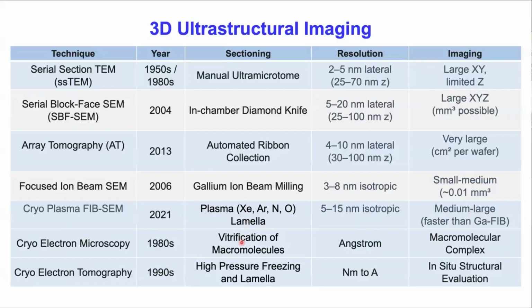And then this is going to be used for 3D. As you already know, single particle analysis can be done for 3D imaging of macromolecules. It has been developed since the 80s, and after the development of direct electron detectors, multiple lenses, and along with the development of software, it is now possible to generate 3D imaging at angstrom resolution by cryo-electron microscopy.